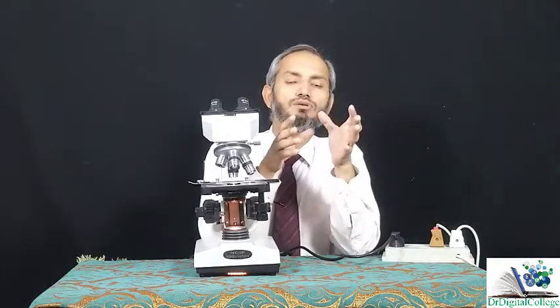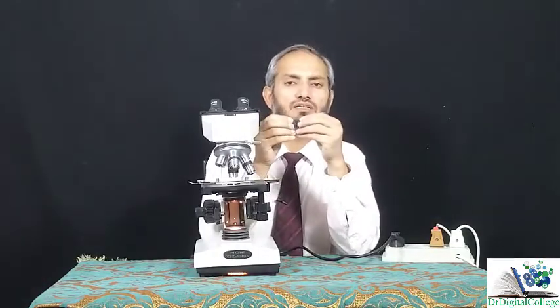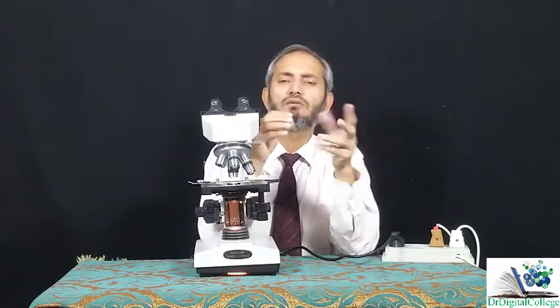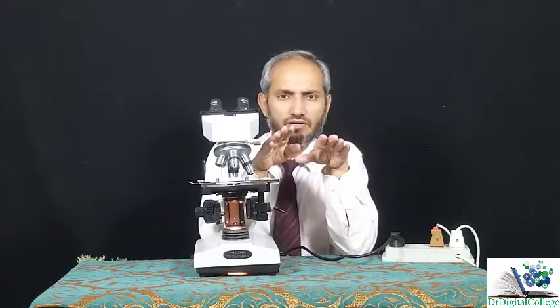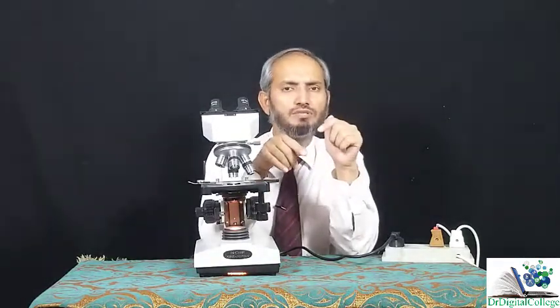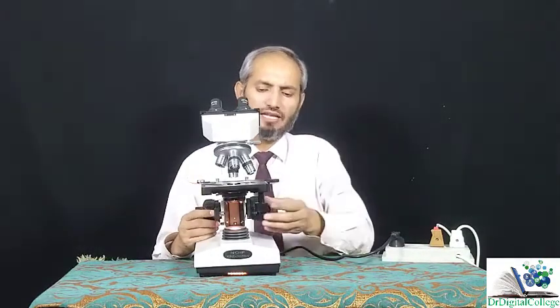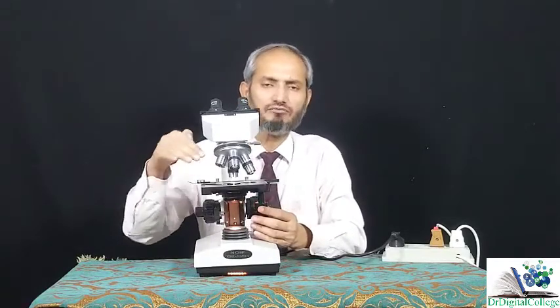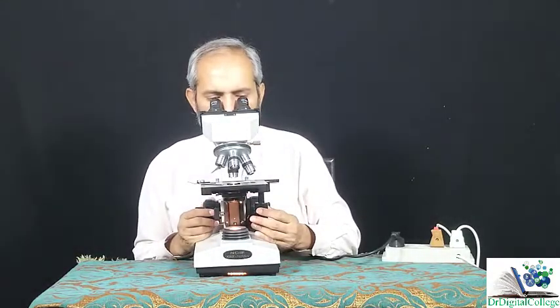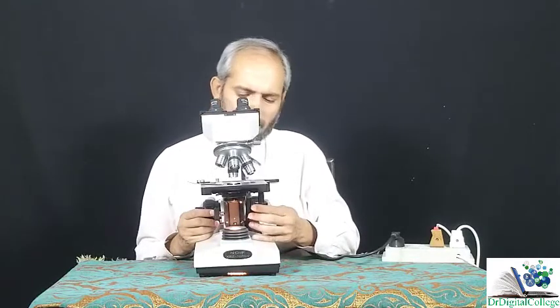You may not be able to observe your object at first. You might be able to observe certain soot particles or dust particles, but do not worry, because if even dust particles are observable, it means the actual object will also be observable. Stop moving your stage up and then move your stage right, left, forward or backward. So right now I have seen some of the dust particles and now I am moving my stage right or left.